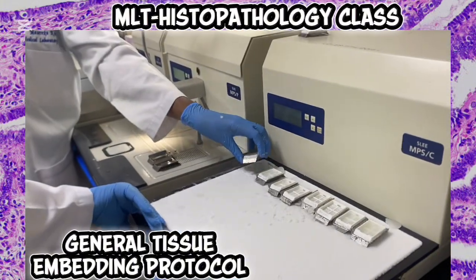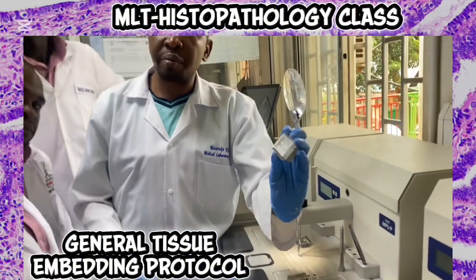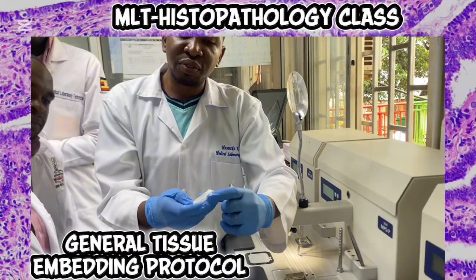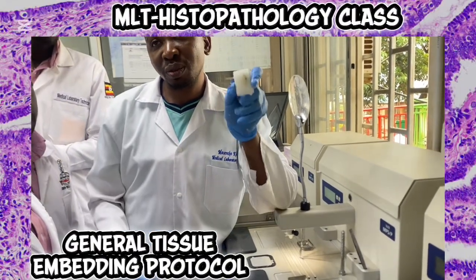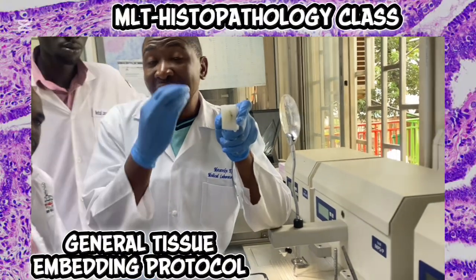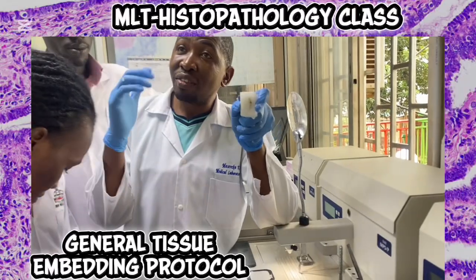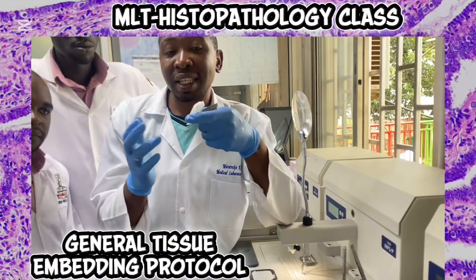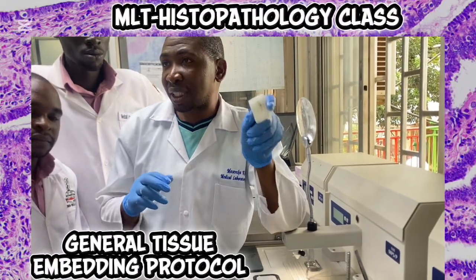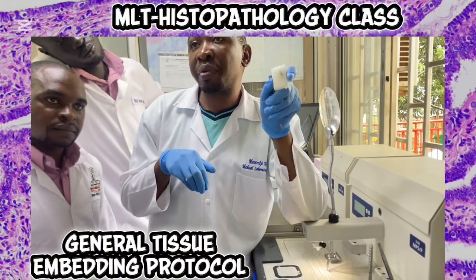After we separate, okay, so this is what we embedded. When you separate, you're forming a tissue block. So it is this tissue block, literally the representative of the whole specimen. For example, if it is the whole breast, the whole breast is not here, but we sampled different parts of the breast.